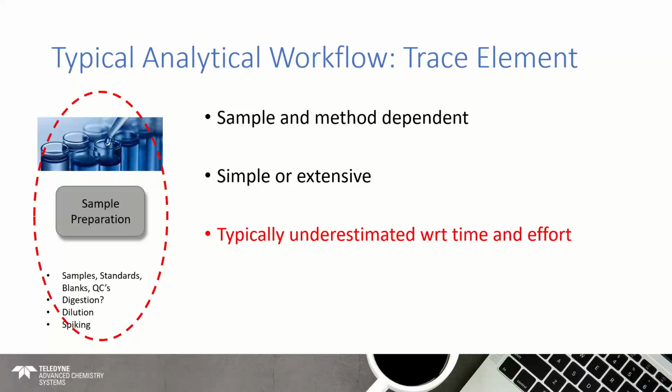That's going to take more time in the processing. But all told, what we typically hear from customers and from experience of our own, the sample preparation aspect of the workflow is underestimated with respect to time and effort. So this is where we're going to focus today.